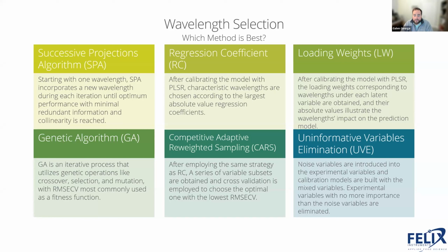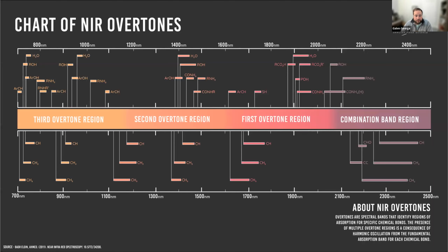And so these are all well studied, and they've been used in literature and academic studies. But when it comes down to it, what we're trying to do with this is select where the most important information is in our wavelength range from our instrument. With the F750, we're looking at mostly the NIR range, right? We're looking right from 700 to 1200 nanometers. And there's some information there. There's some third overtone information about CH bonds and NH bonds. But really, we're dominated by the OH bond.